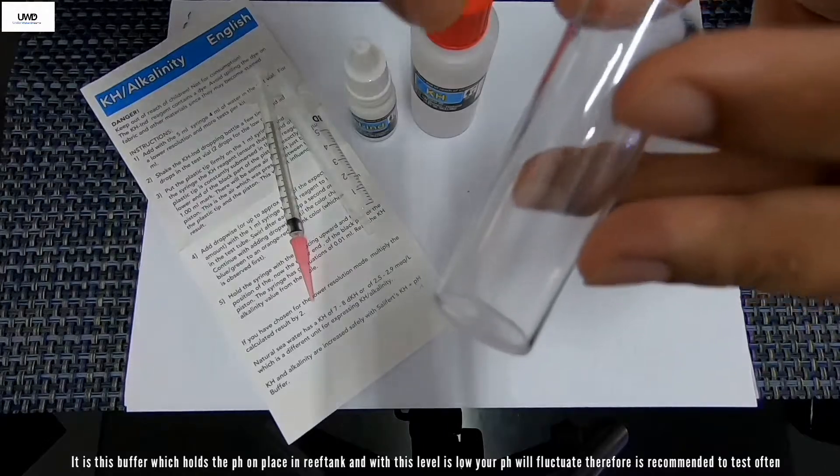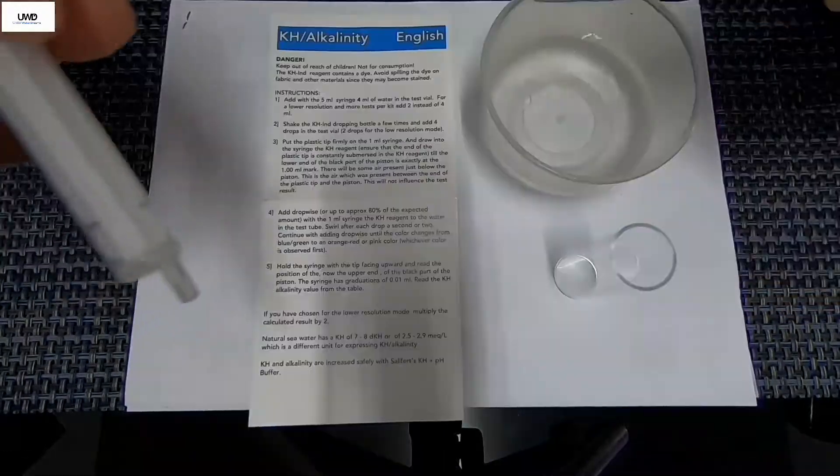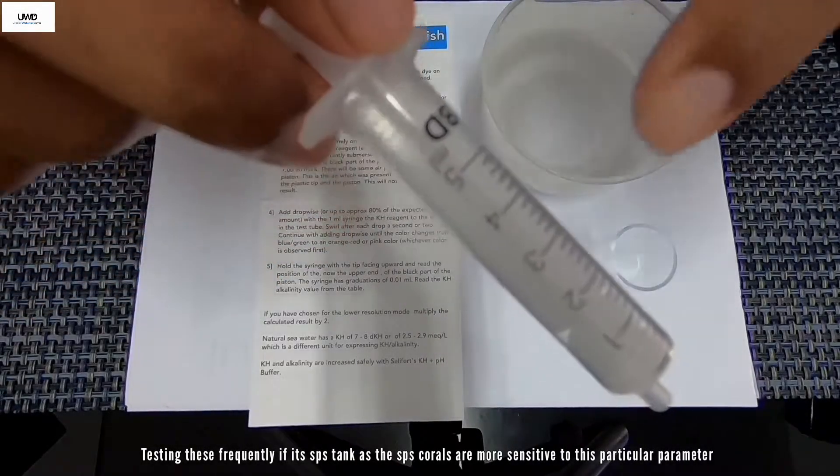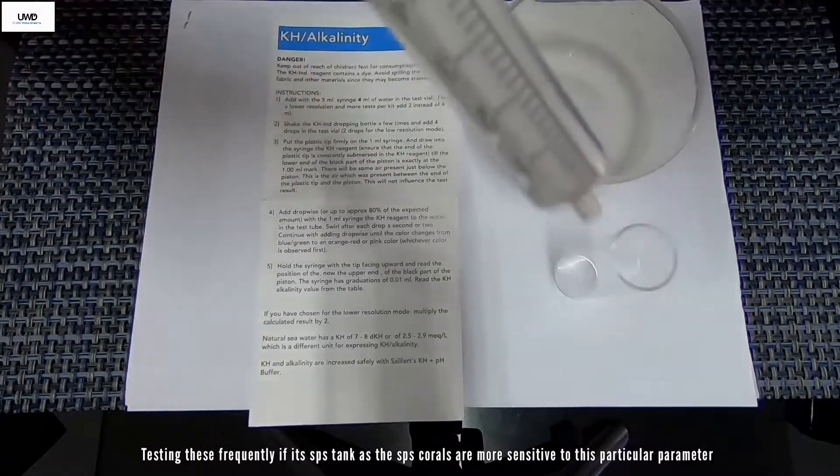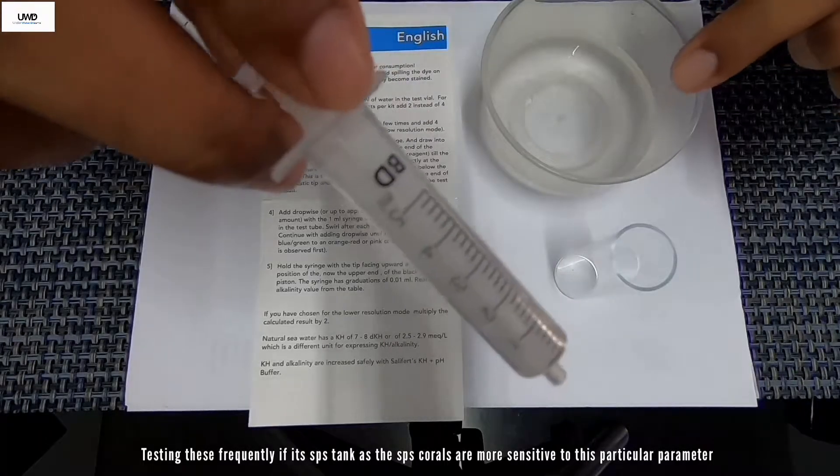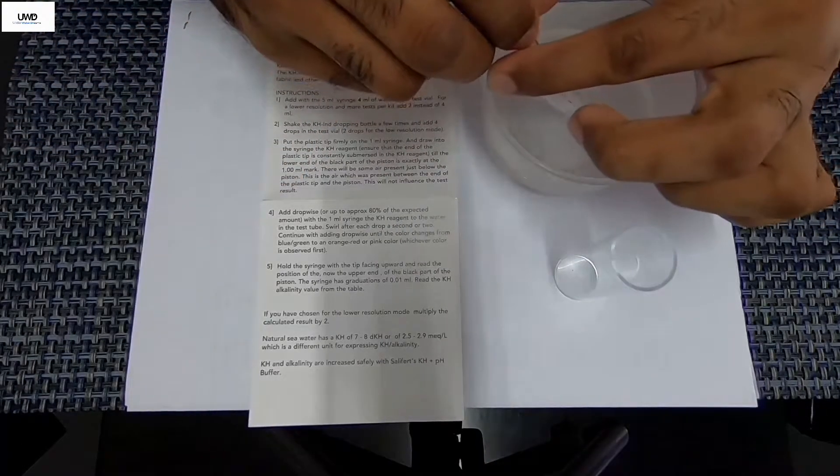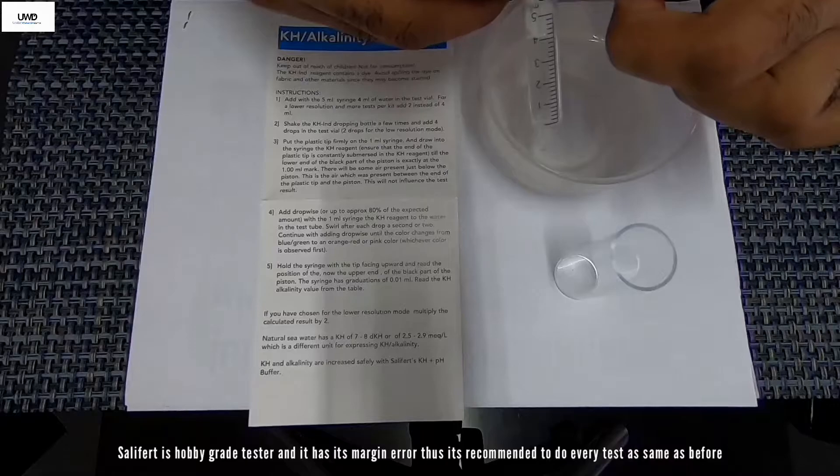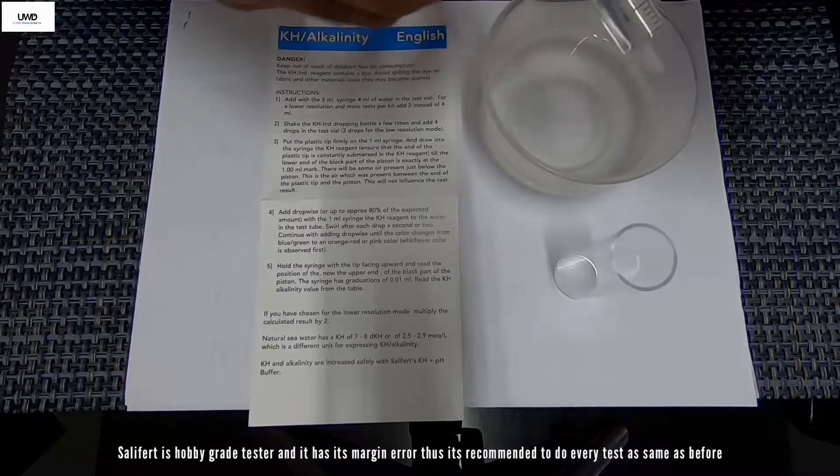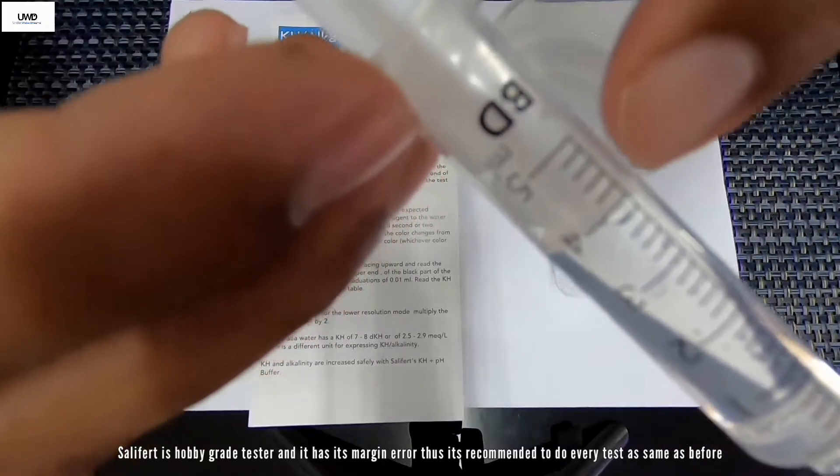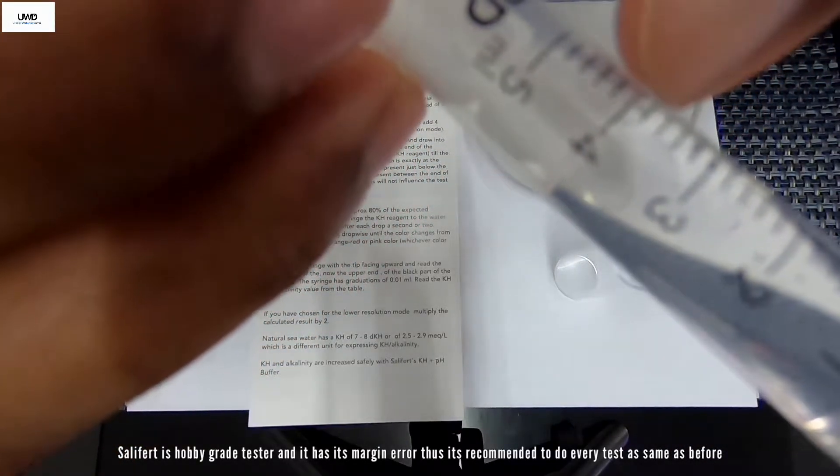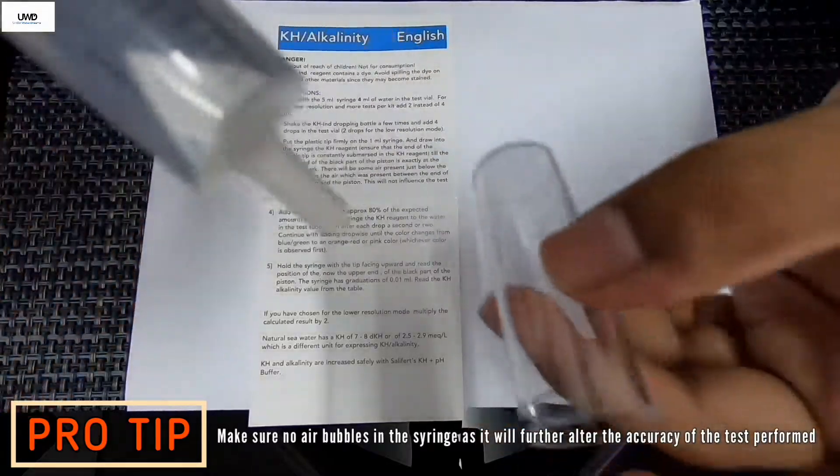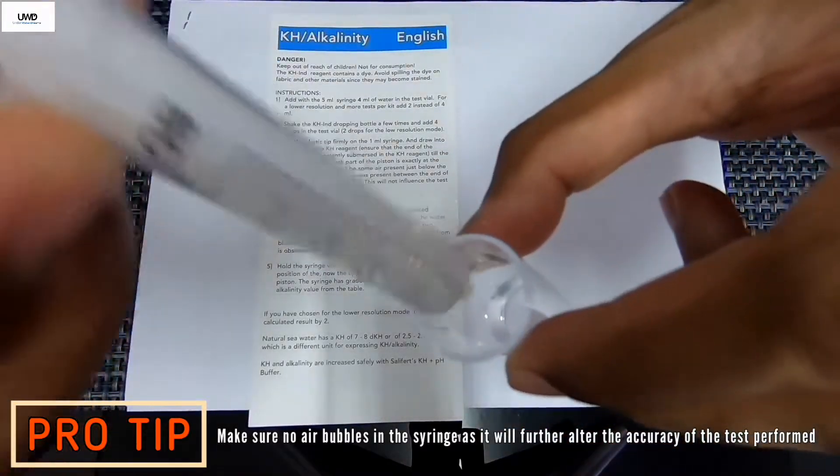First step, I'm going to be drawing inside this syringe 4ml of aquarium water or reef tank water. This is what we're going to be testing. While you're drawing inside here, make sure there's no bubbles and make sure the plunger is at the 4ml mark. Now I'm going to put this 4ml of water inside this test vial.